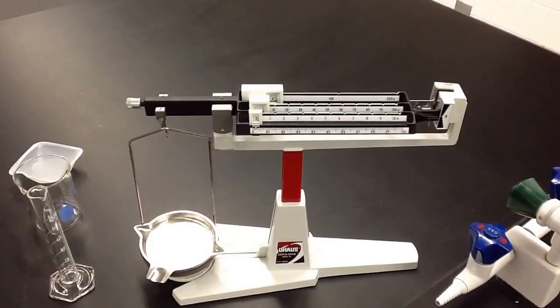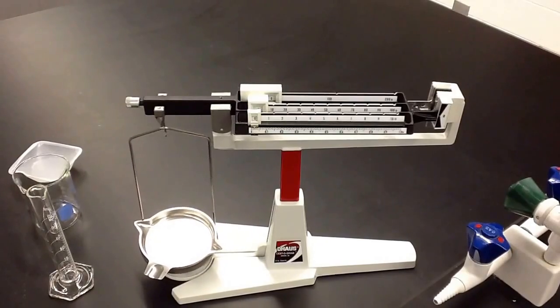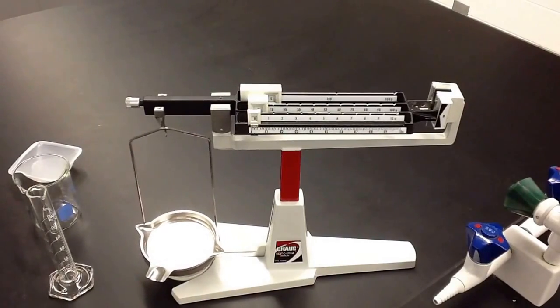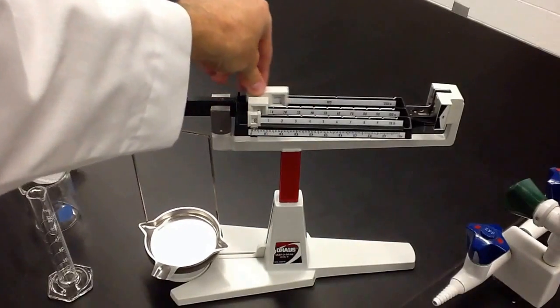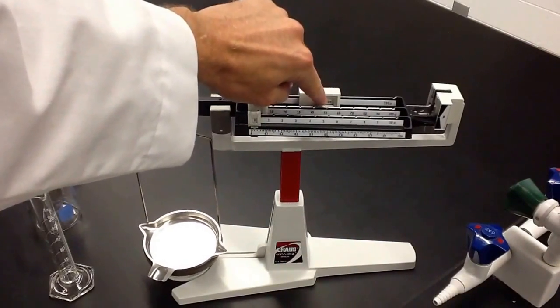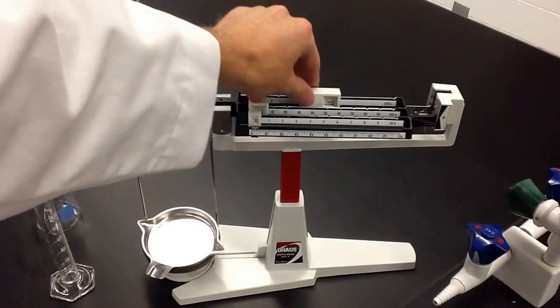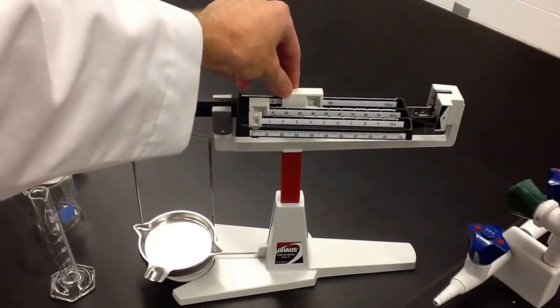The first piece of equipment we're going to deal with is the four-beam balance. This is what we'll be using pretty much every time that we're in lab. There are four beams and you always start with the hundreds right back here. There are little notches that these fall into and you should be able to see through the little window — you should see the number. You never want to leave this in between where you can't see a number whatsoever.